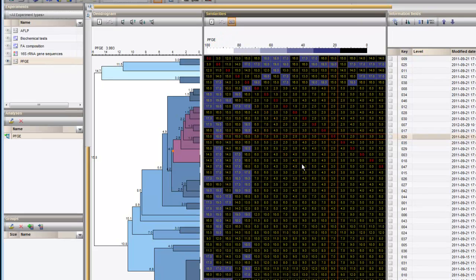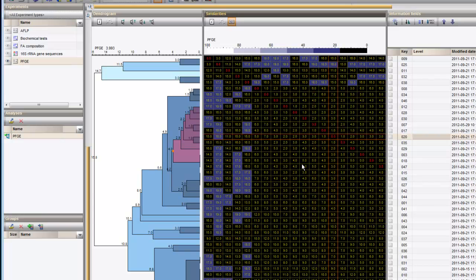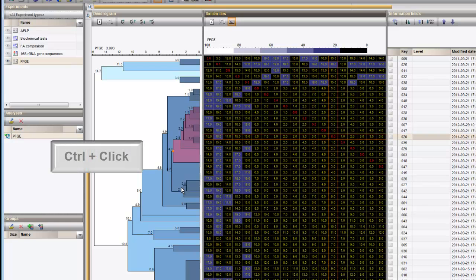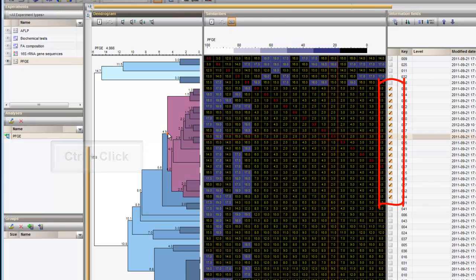Clusters of entries can be selected directly on the tree. To do so, I hold down the Ctrl key while clicking on a branch. The result is that all entries of that branch are selected.